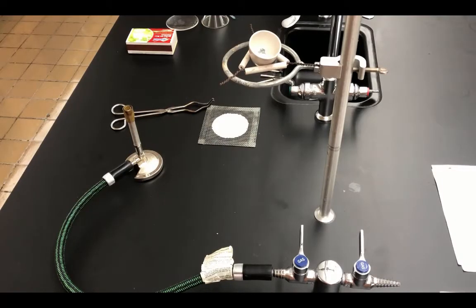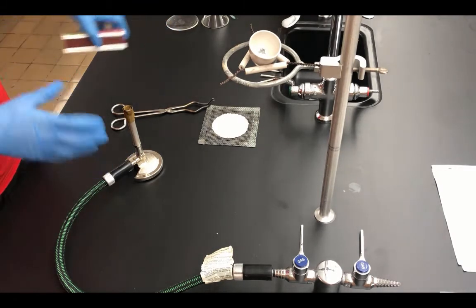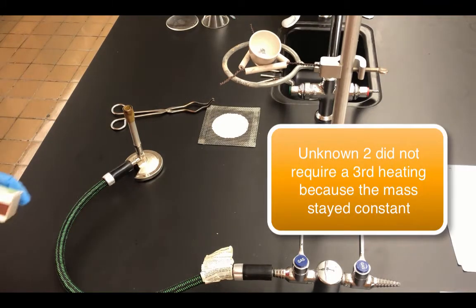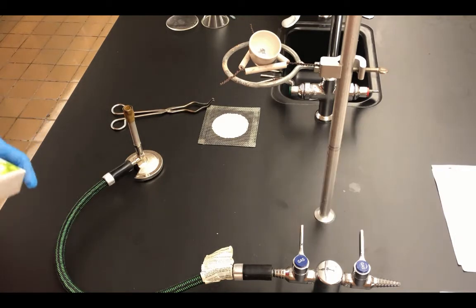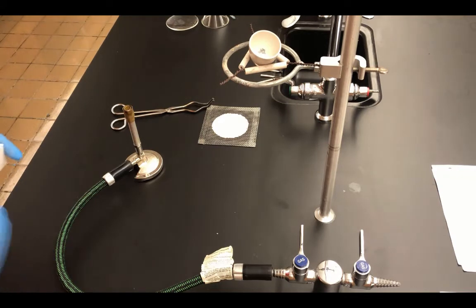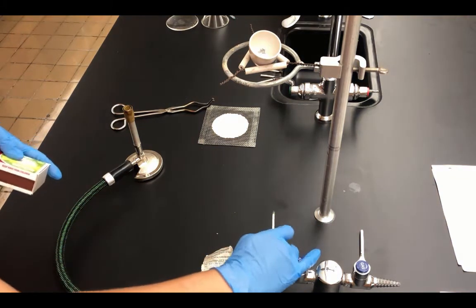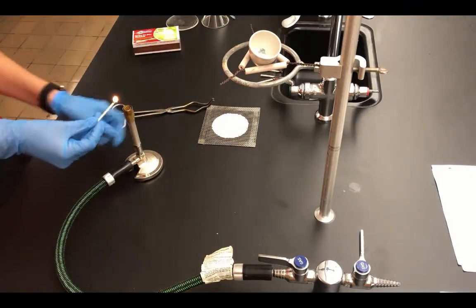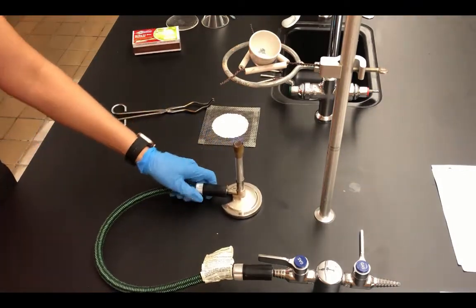Now, since the mass did slightly decrease when we just found the mass, I am going to heat it for a third time. So even though it changed only by 0.01 grams, I do want to make sure that any water that is in the crucible or in the substance is removed. So I'm going to do one more heating, and hopefully the mass doesn't change from this final heating.